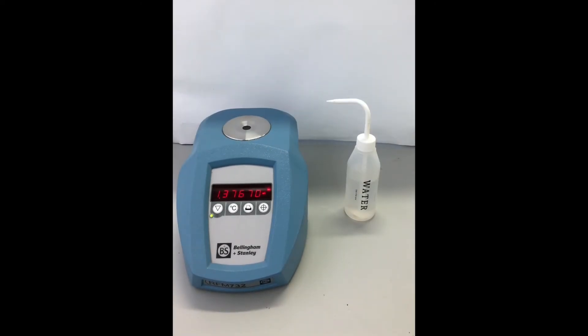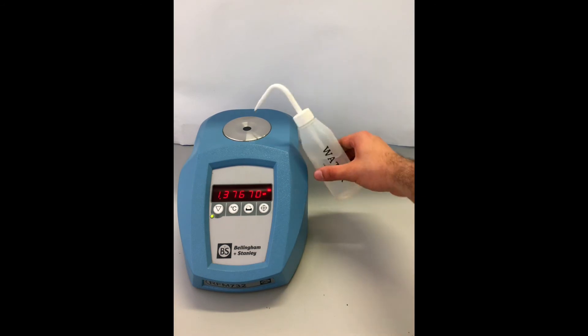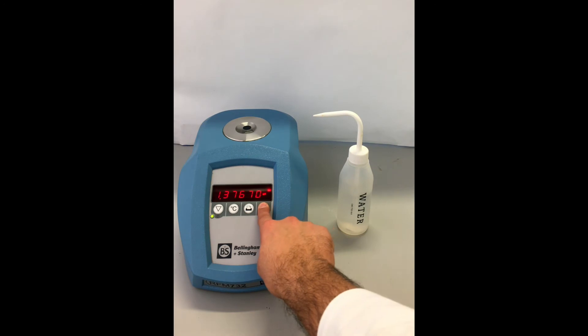If another figure is displayed, you need to inform a technician and recalibrate the refractometer. To recalibrate, add distilled water and then press and hold the calibrate key for 2 seconds until you see Cal? displayed.